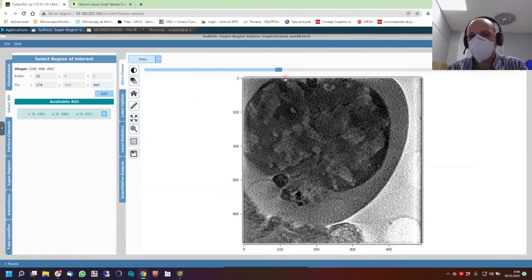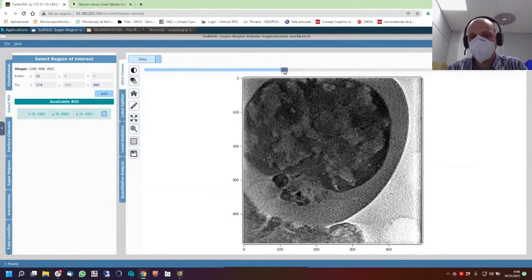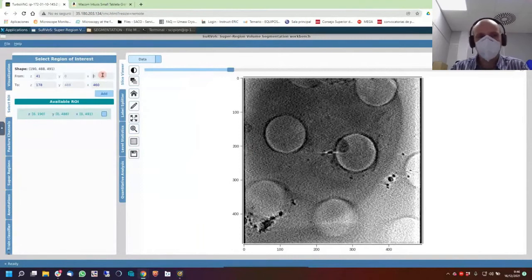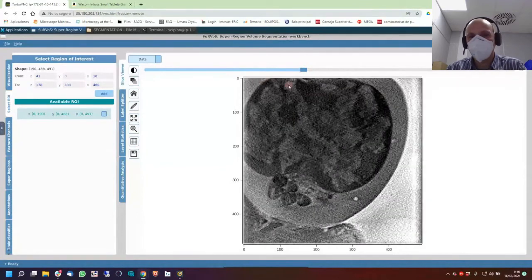And if we go to the other part, I think it doesn't make sense to trim too much. Maybe just a little bit here, for example. So it's going to take 10 pixels from this part. I hope that everyone more or less understands what I'm doing. I'm just going for the limits of the region that we are going to use in XY coordinates. So, let's try to trim just 5 pixels here.